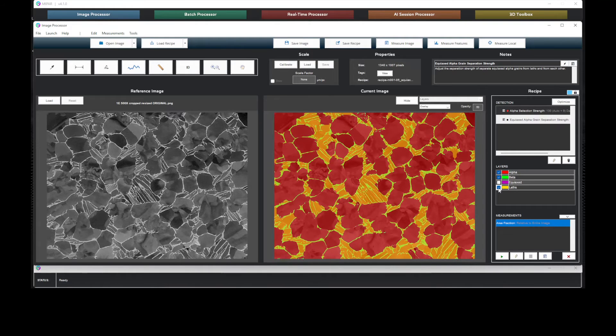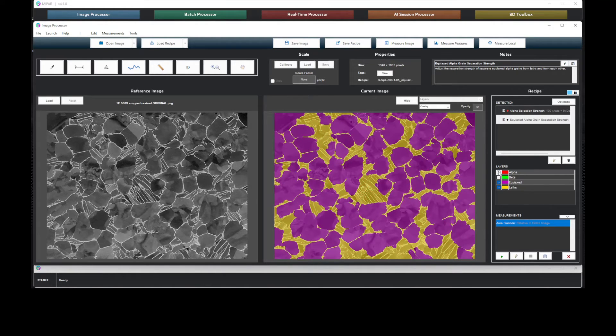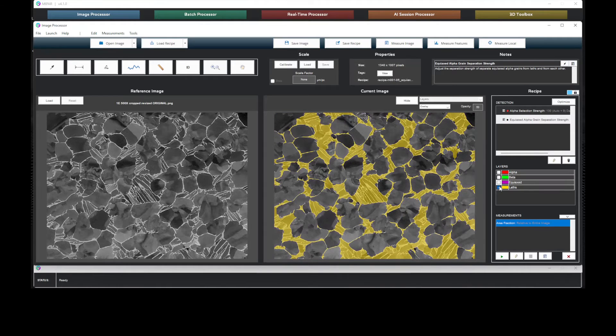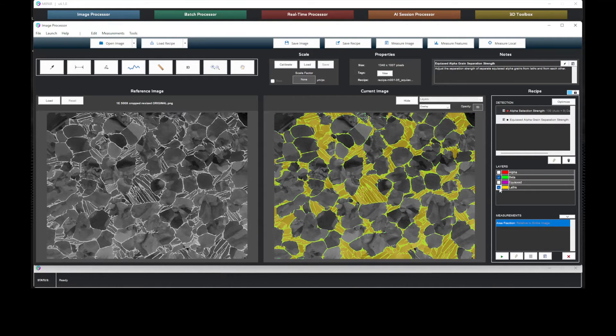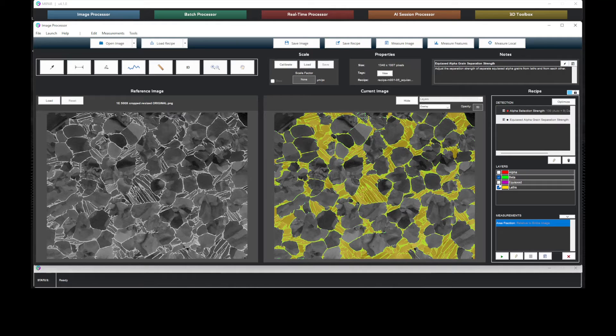Here we can highlight the phases individually or display them all together.